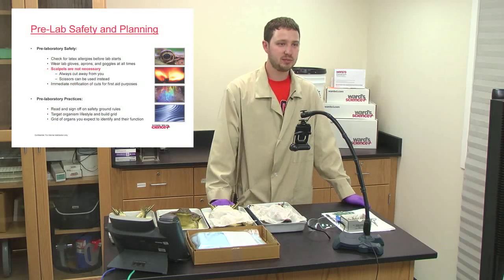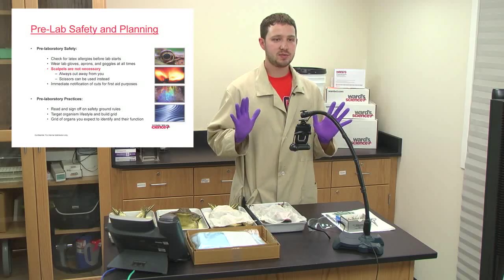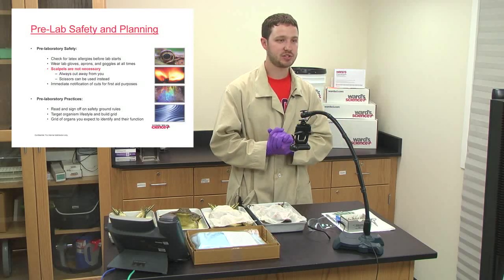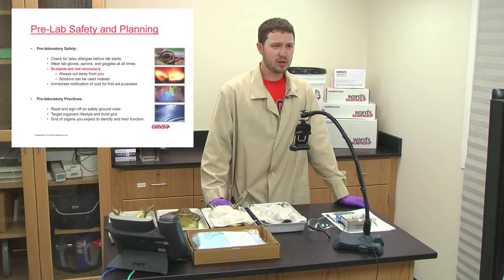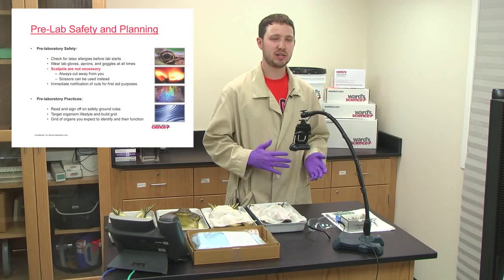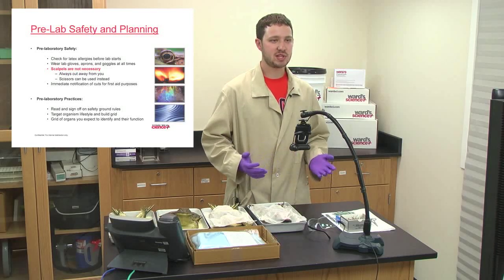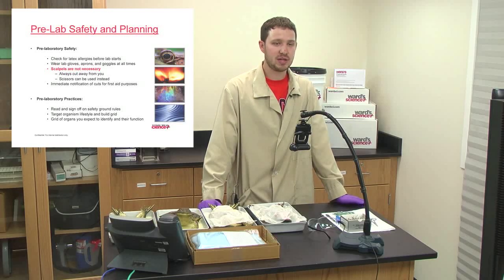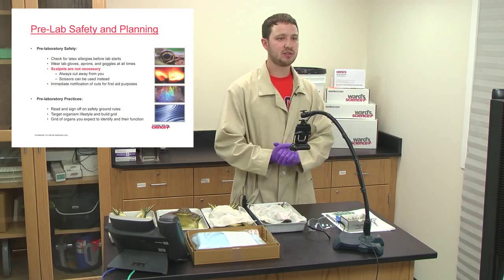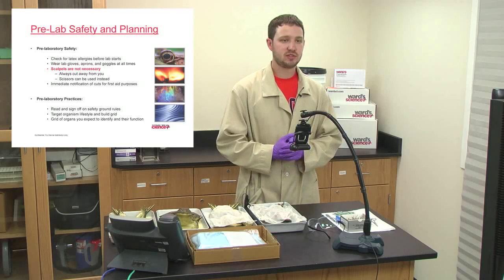Let's briefly go over pre-lab safety and planning. You'll want to check for latex allergies. You'll always want to wear gloves and possibly an apron and goggles at all times when doing dissections. I wanted to make it clear that scalpels are not necessary — I won't be using one today. If you're doing dissections with middle school or high school students you may want to stay away from scalpels, as they can cut organs, veins, or arteries you may be testing on later. I would also encourage you to read and sign off on a safety ground rules sheet.